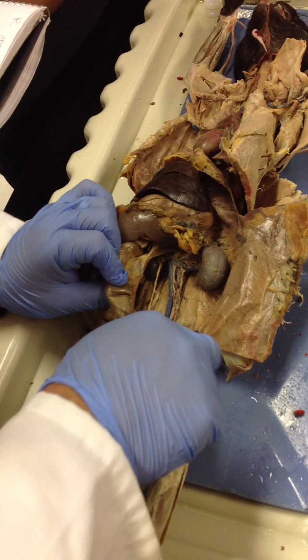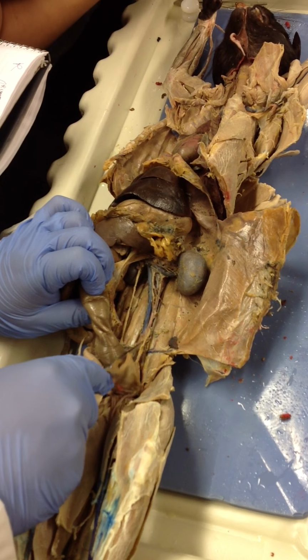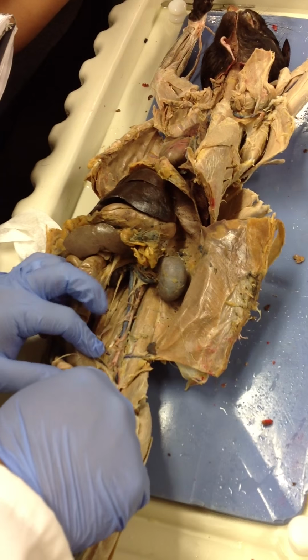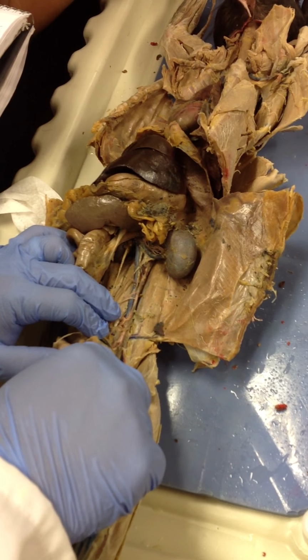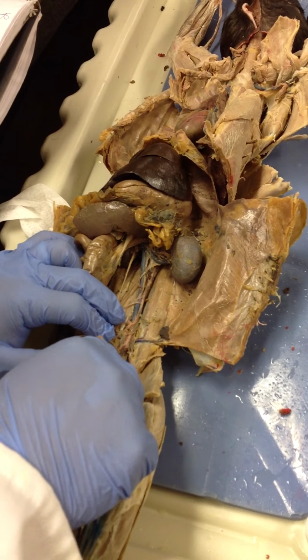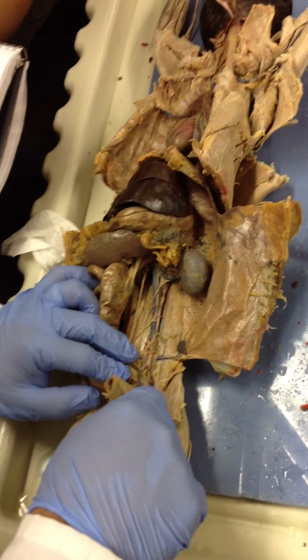actually on this cat it ripped. But this little nub would have been the inferior mesenteric, and you see the rest of the nub is right there. And then from there you go down to your iliacs. So you have your external iliac right here. And then just a little further deep to that are the internal iliacs.